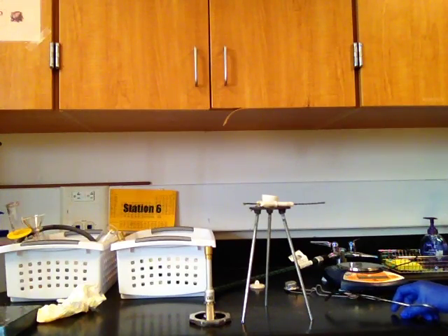In this lab, there are many sources of error. So in terms of error analysis, I'm going to give you a few scenarios. Think about those and think about how they will impact the percent of hydrate in the formula. We will discuss these in class.